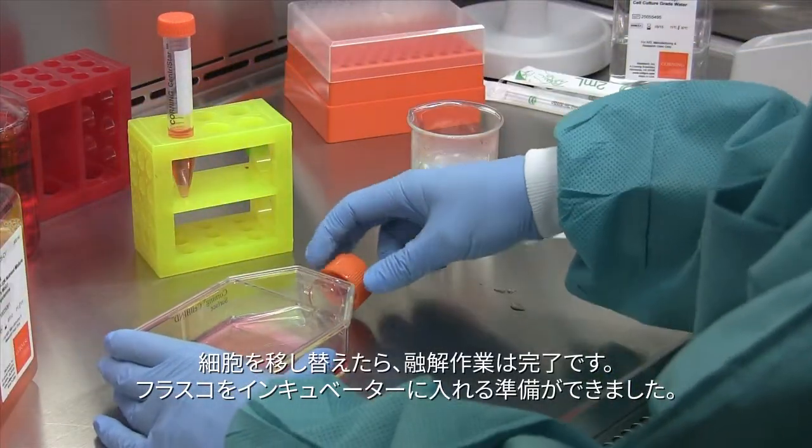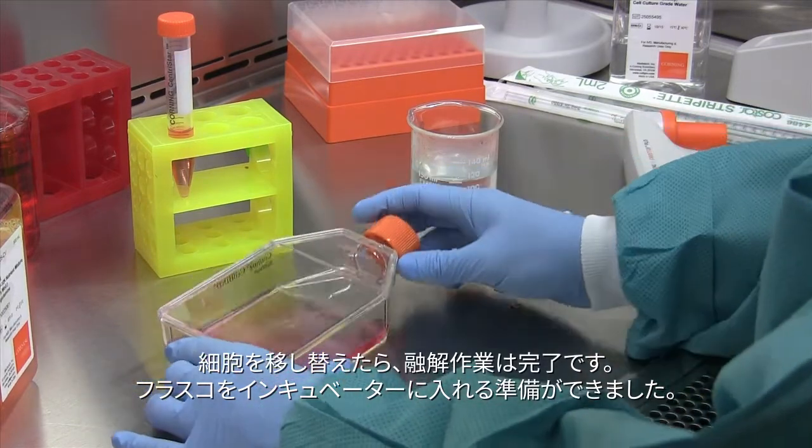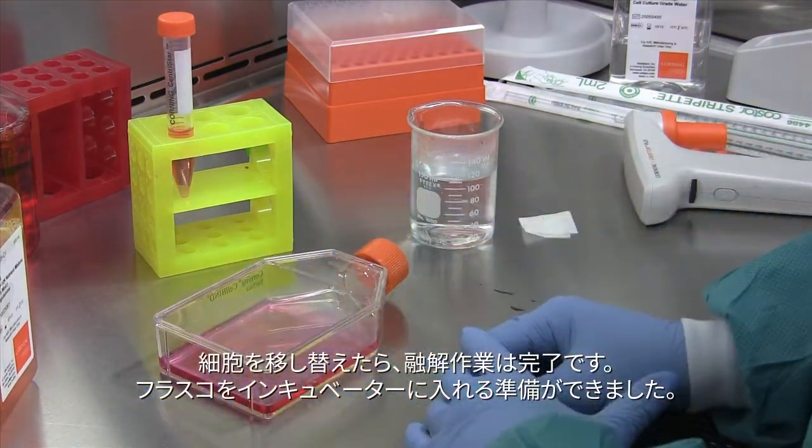Once the cells have been transferred, you have successfully thawed out your cells and the flask is ready to go in the incubator.